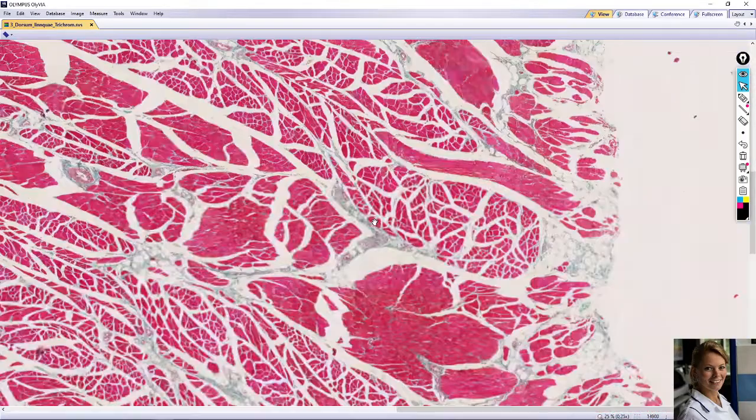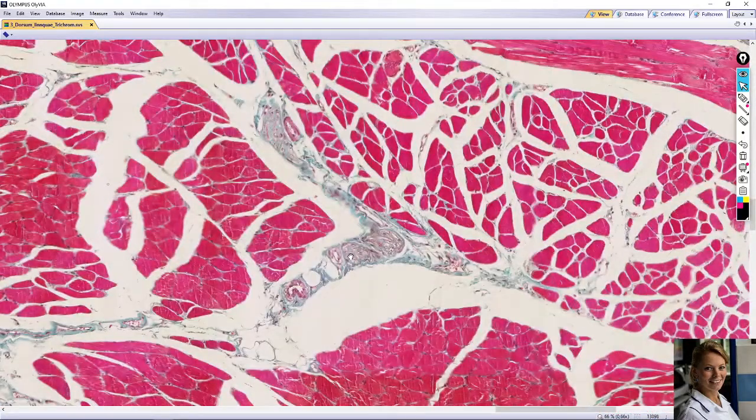Here you can see very nice sections of nerve fibers.